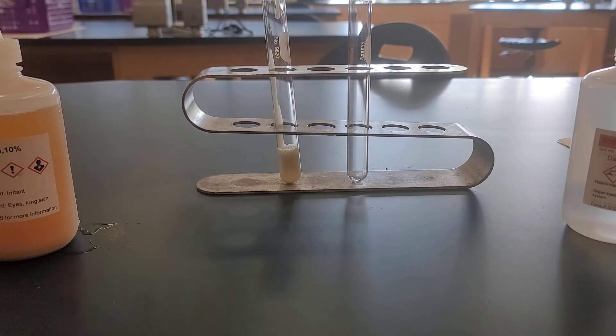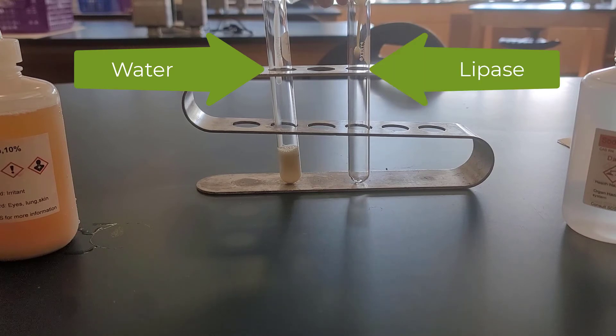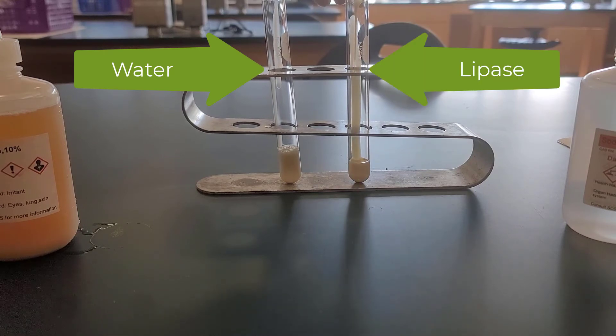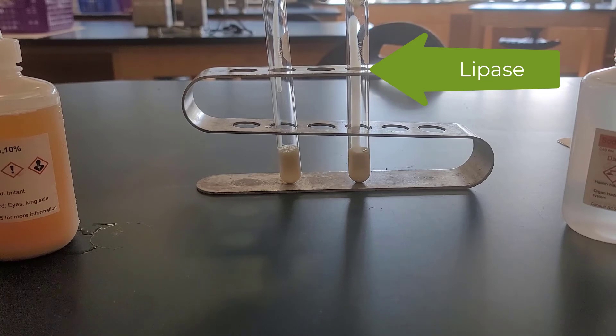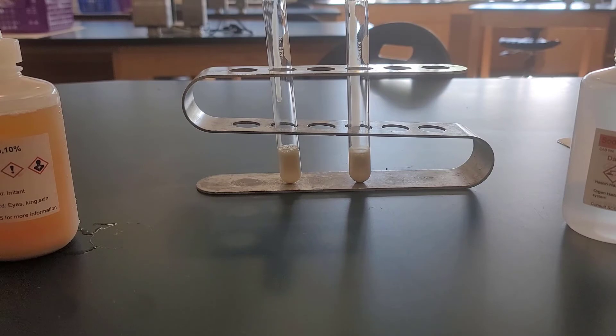In tube two, we're going to have five milliliters of canned milk, just like we did in tube one. We're going to have three milliliters of lipase. In this case, we store ours on ice on the back shelf. So that's going to be the difference—the water and the lipase are going to be the difference between tube one and tube two. In tube two, we're also going to have four milliliters of litmus solution and three drops of two percent sodium hydroxide.